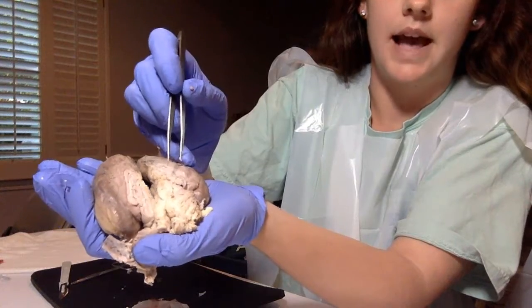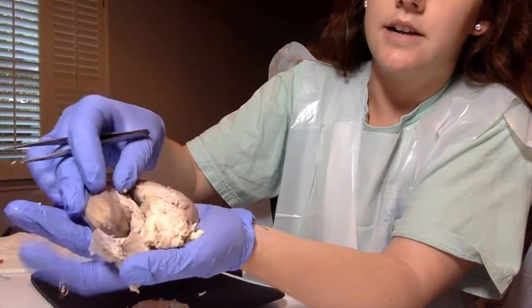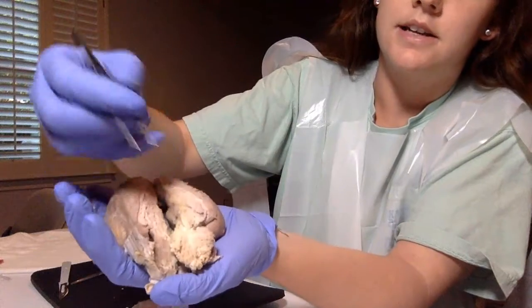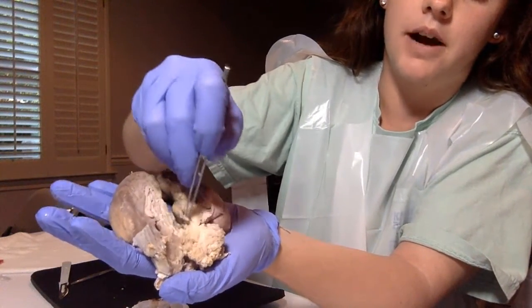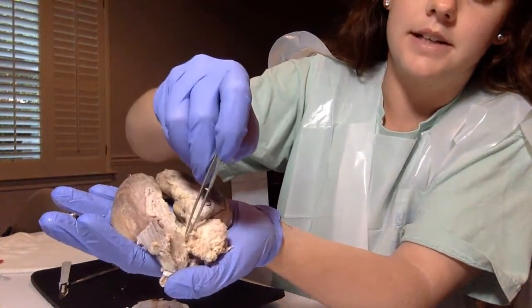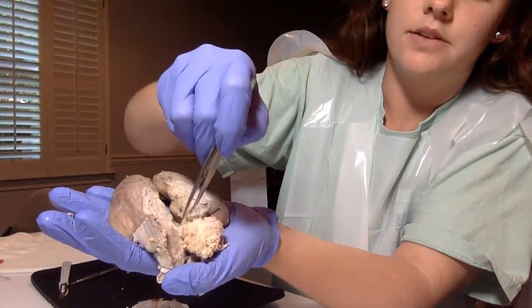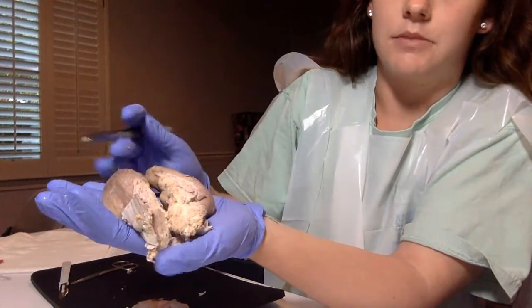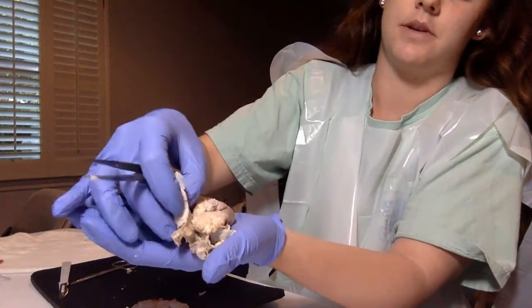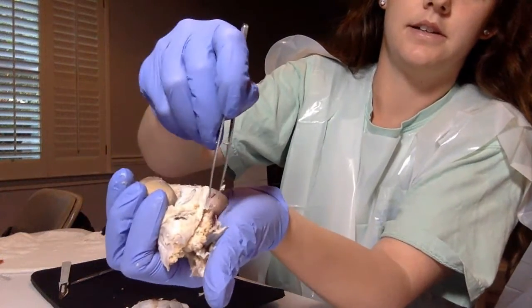And then we have the medulla oblongata, which is kind of hard to point out on my brain because when I dissected it down the middle, it kind of messed things up going towards the bottom. But the medulla oblongata is going down this way, headed towards the spinal cord. Then the cerebral cortex, here where the cerebrum is, in this area.